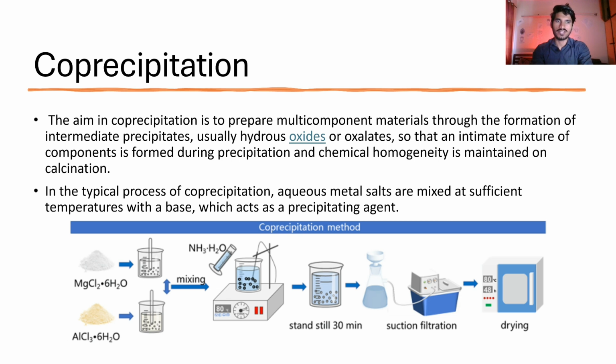Using this method we can form oxides, we can form oxalates, we can form hydrous oxides, and at the end what we have is chemical homogeneity when we perform the calcination reaction.